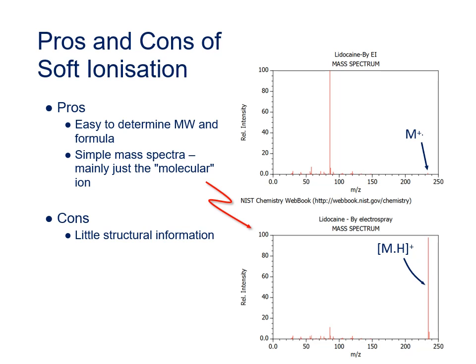However, there is a con to this soft ionization, and that is that because you're not seeing significant fragmentation, you actually get much less structural information about the molecule you're looking at. And this structural information is vital in biochemical or pharmaceutical analysis, because it's the only way you can distinguish between multiple possible isomers that might all be in the system you're looking at.